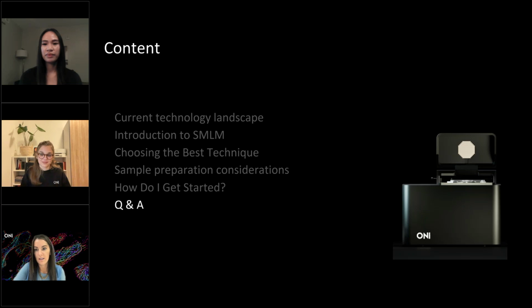So the next question is from Sadiq, and they are asking, do you have any experience with samples which are prepared using click chemistry tool? For example, I am clicking my probe with Cy5 in fixed cells. So is it possible to use SMLM?